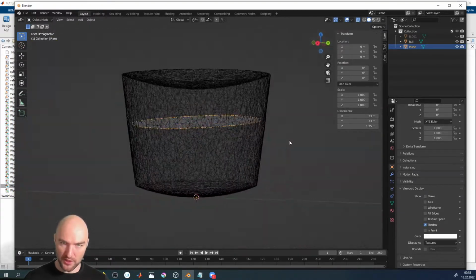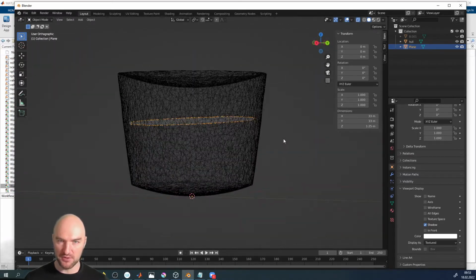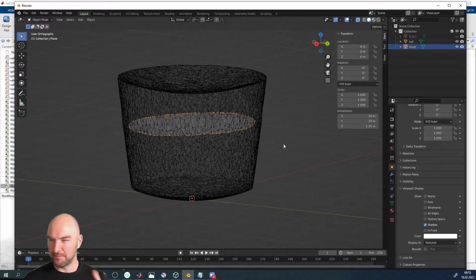And so what we're going to do now, we're going to go back into MATLAB and use a couple of funky algorithms to make that a bit of a better approximation of where our grain boundary is. But there might always be a little bit of manual labor involved. Okay, and how do we re-import that?